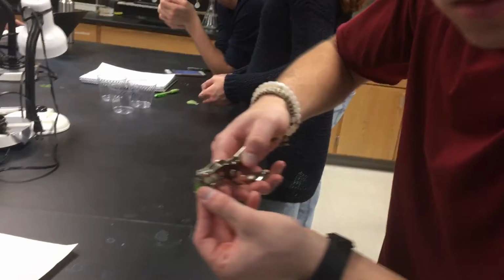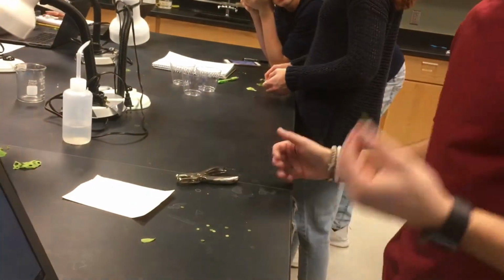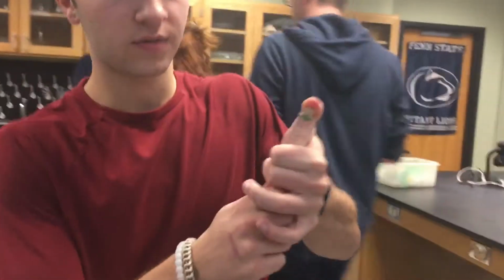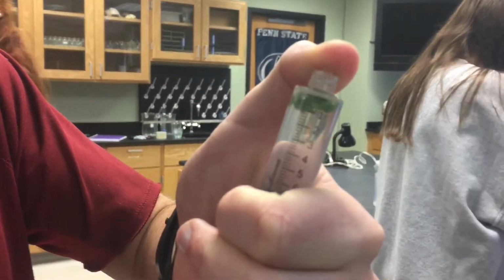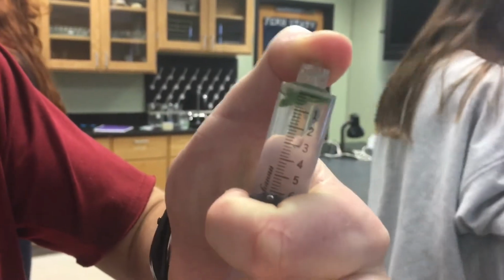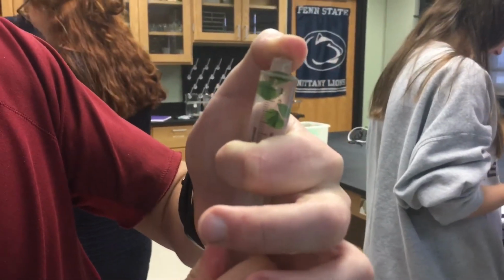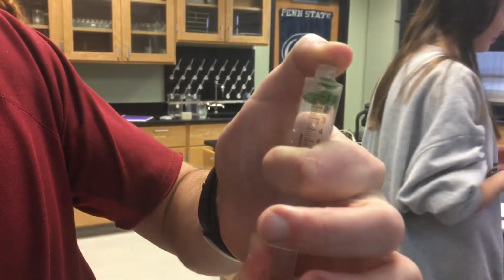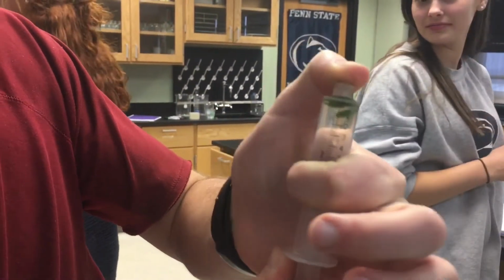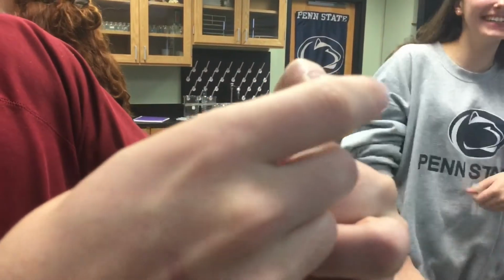The procedure consists of making leaf chads using a hole puncher, inserting these leaf chads into a syringe. Once the leaf chads are in a syringe, fill the syringe with sodium bicarbonate and create a vacuum to release all the air trapped within the leaves. To do this, put one finger over the top of the syringe and pull down with the plunger. What this does is create a vacuum and allows the leaves to sink so we can determine when they float due to the release of oxygen.